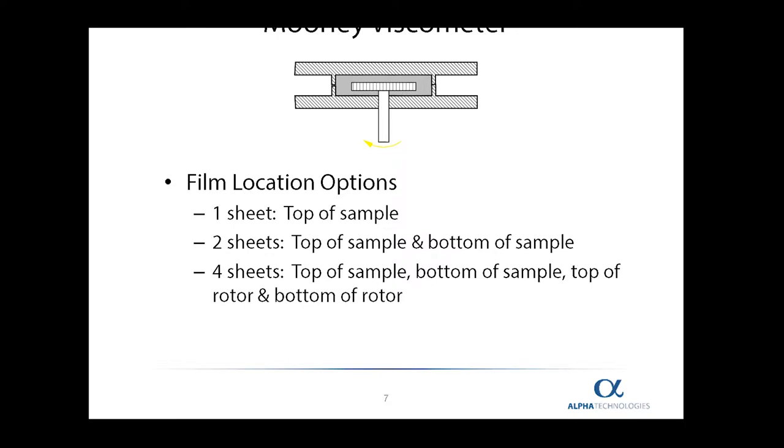There are three different popular combinations of film used in the Mooney viscometer. The simplest is to use one sheet of film on top of the sample. The second most popular is to use one sheet on top of the sample and one sheet on the bottom. In some cases, when the material is exceptionally sticky and difficult to remove, there is one sheet on top, one on the bottom, one on the top part of the rotor, and one on the bottom part of the rotor — four sheets total. This can have an effect on the data, but it is much easier to clean and change samples.